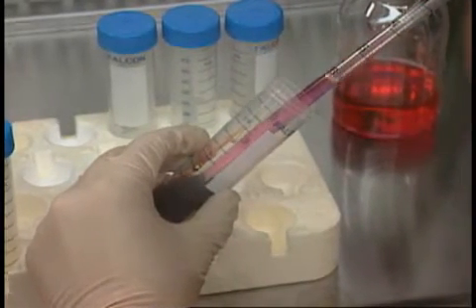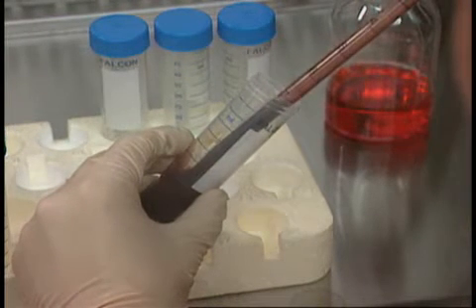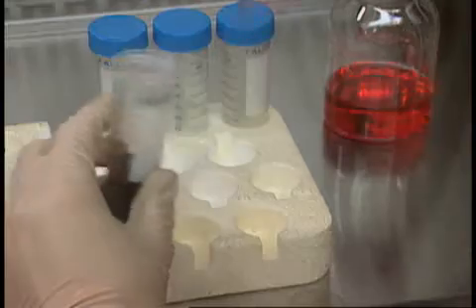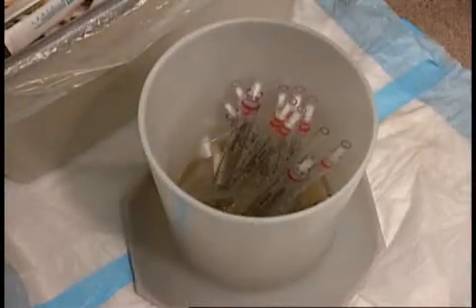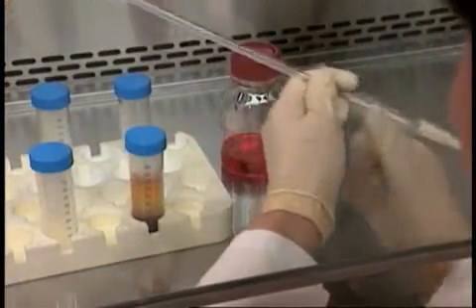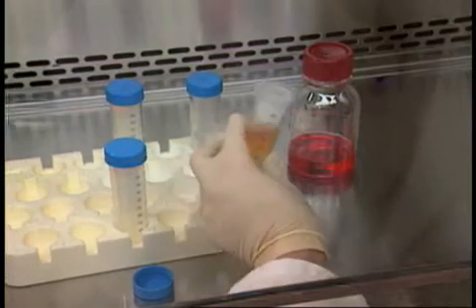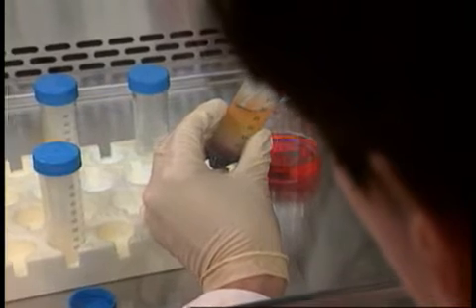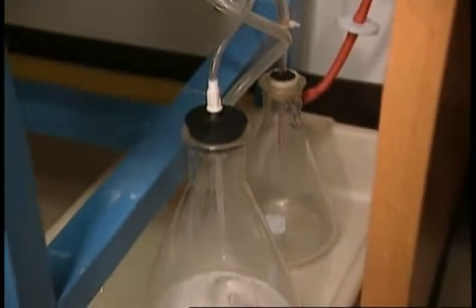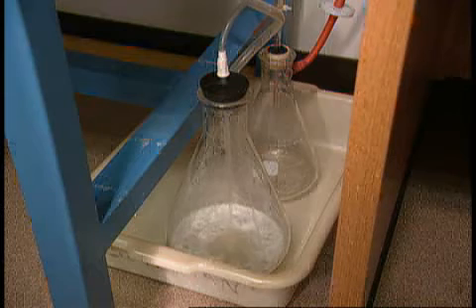When mixing fluids with a pipette, Cricket takes great care to avoid aerosols or splashes. All tissue culture work involving infectious agents is done with disposable pipettes. After spinning the sample, Cricket prepares to isolate the lymphocytes in order to immortalize them. The vacuum trap containing a bleach solution to kill organisms is placed on the floor, protected from accidental breakage.